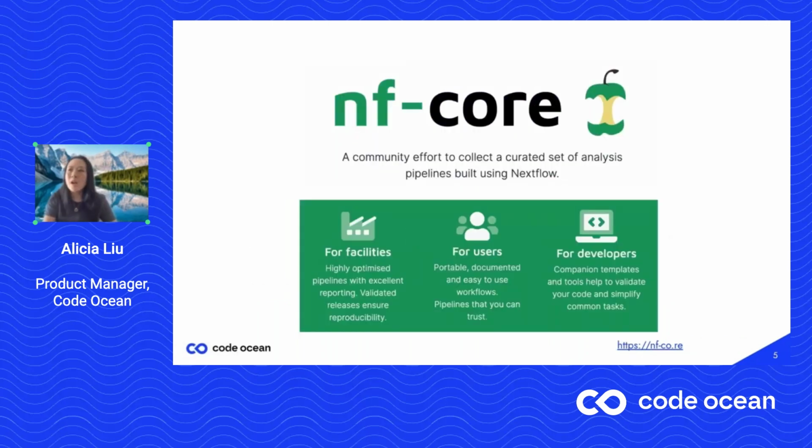Now, back to NF Core. The NF Core community provides essentially a set of guidelines that are the best practices that the community adheres to. So these are going to be guidelines to benefit both facilities and downstream users of these pipelines. So things like ensuring that there is always proper documentation and ensuring that these are validated pipelines that you can use and trust and reproduce. These are also best practices for the developers of these pipelines. So companion tools, automated tests that every pipeline has to pass for validation and release. And because of all of this, we can say that these are indeed best practice pipelines for the community.